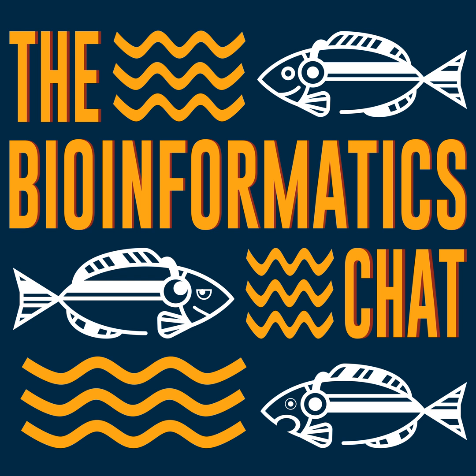So we take our disjointigs and compute all possible local alignments within this set of disjointigs. But it is easier to do than computing pairwise alignment between the entire set of reads because you have much less sequence now. So disjointigs compactly represent your read sets. It simplifies the read representation: you collapse all your redundancy in reads into a single disjointig or multiple disjointigs. So it's sort of like a consensus sequence.